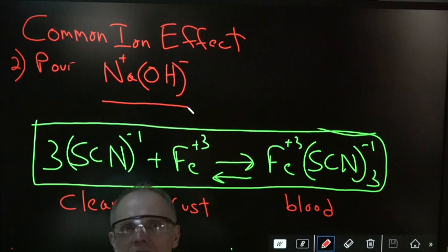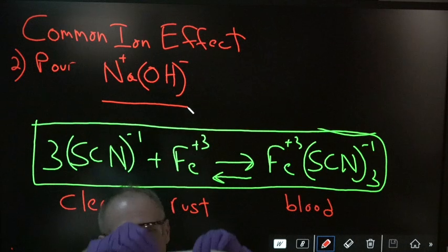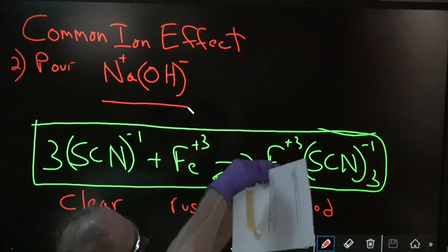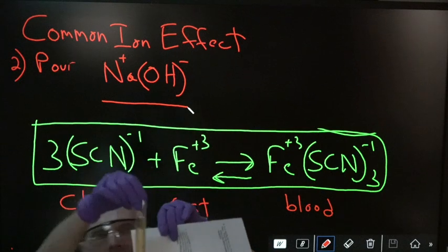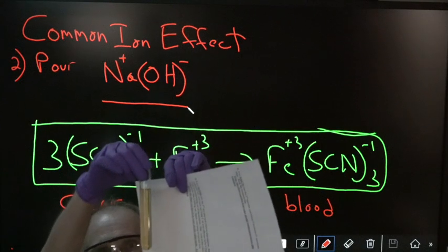And another hint is you should look on the solubility table, reference table F. Look on there and that'll tell you. So hopefully you can see these specks. I hope you can. Let's get a little bit closer, maybe you can see the specks.